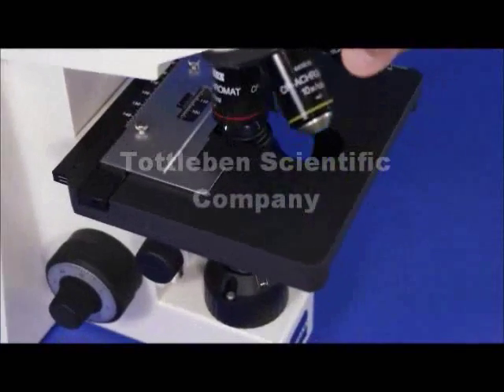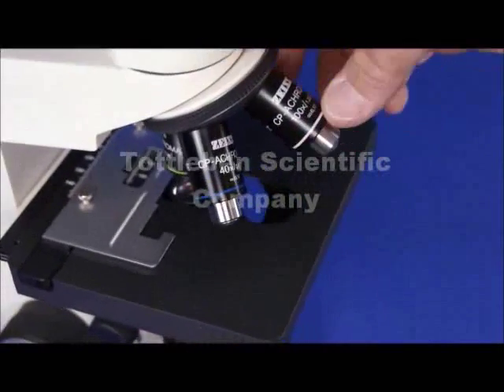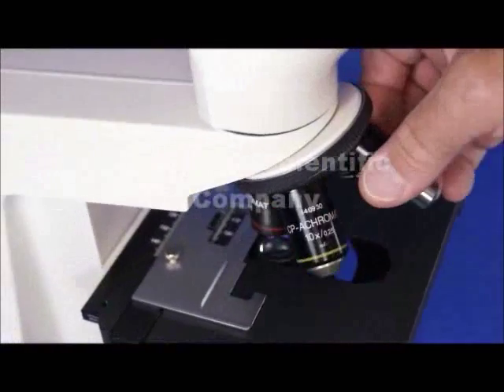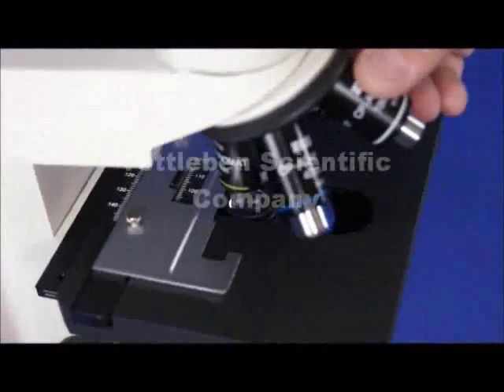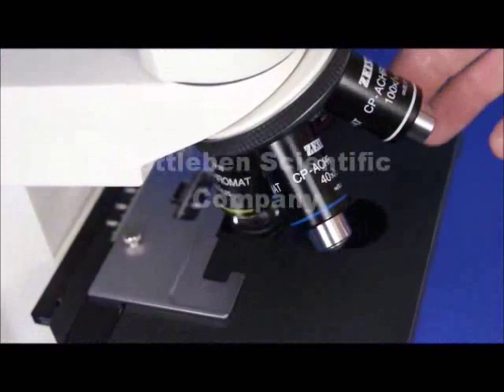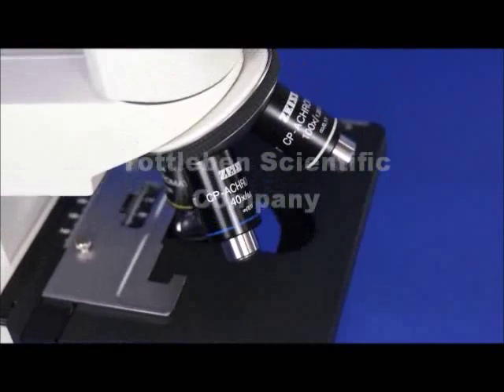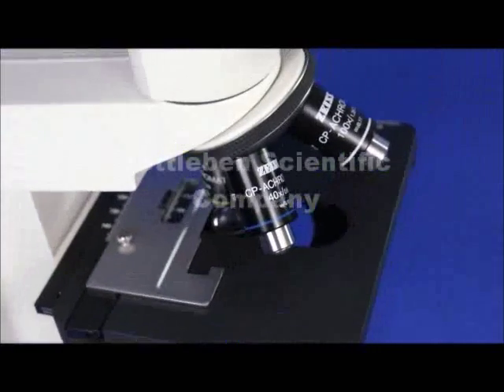Another nice thing about this scope are these plan achromatic lenses. These are highly corrected flat-field Zeiss CP achromats — truly plan achromatic because they are totally flat. You have four objective lenses: a 5x, 10x, 40x, and 100x. They're all flat field, highly corrected, high resolution, high numerical aperture, and infinity corrected.